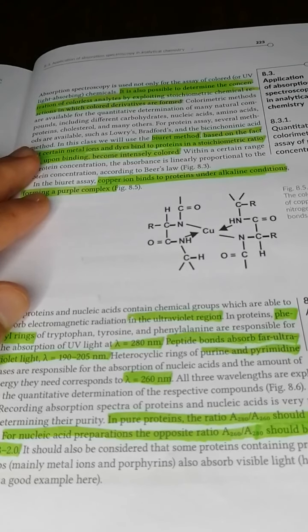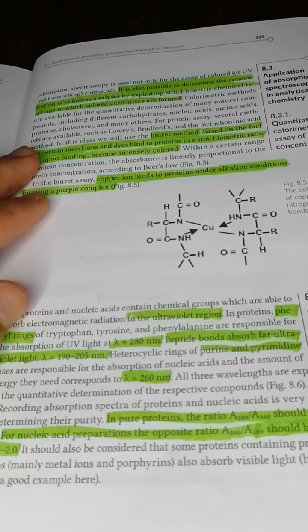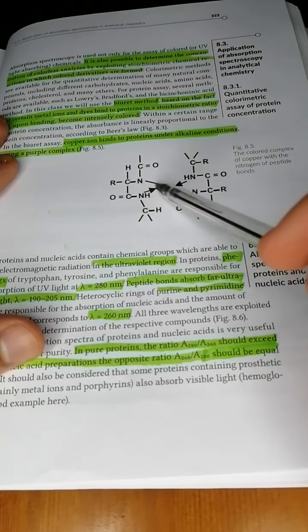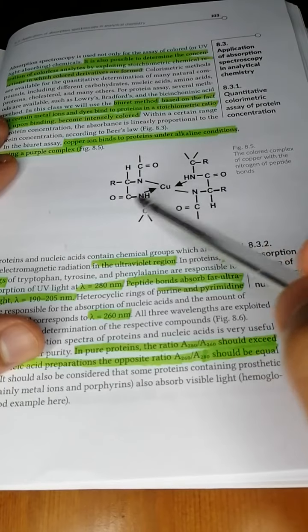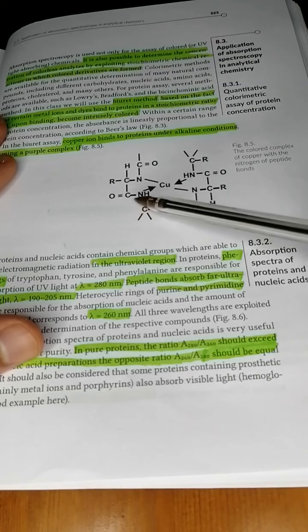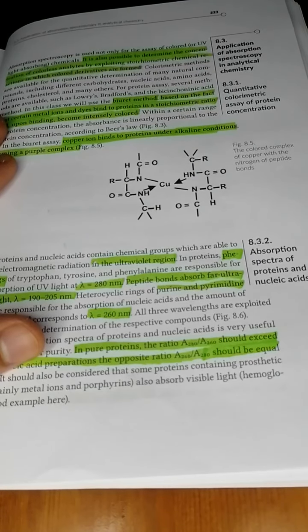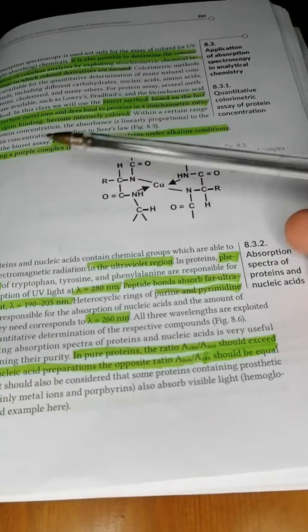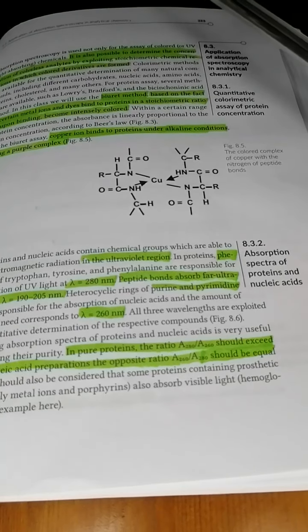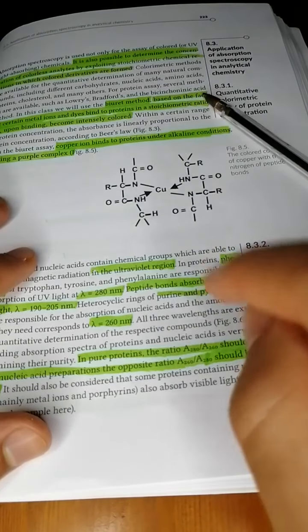However, for non-colored or colorless analytes, we use another method. Like we said, you have certain bonds and certain areas where electrons might be, and these absorb photons at certain wavelengths. This is pretty much repeating what we already said, but what you can also do if you have a colorless solution is use stoichiometry.